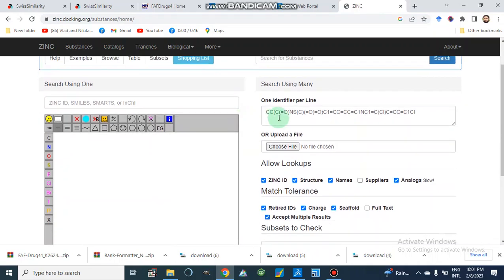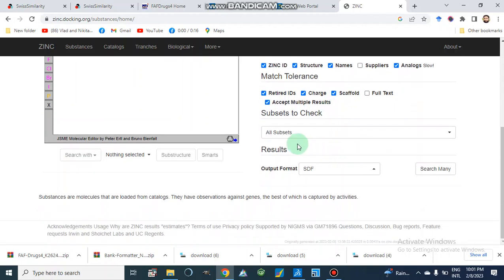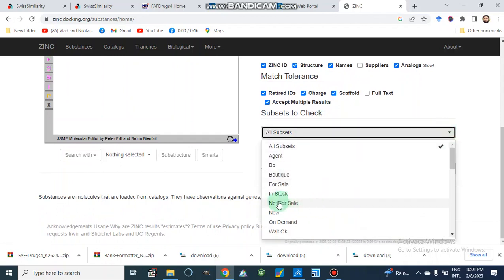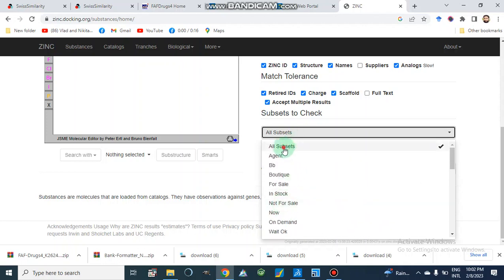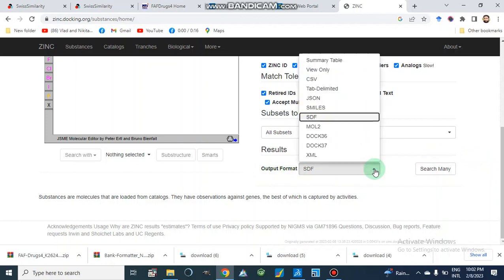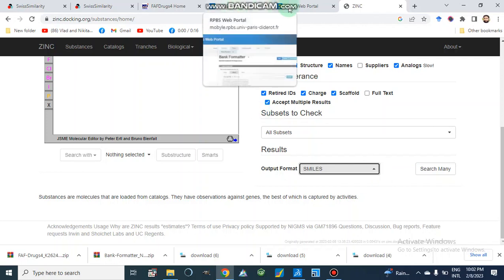Here, if we are going to use the ZINC database, we will make a compound and the SMILES of the compound will be pasted here, or we can choose a file which contains SMILES. On the basis of ZINC ID, structure names, analogs, suppliers, and other parameters, we can select compounds. We can also filter for sale, in vivo, in vitro, or select all subsets. The output file format may be SMILES or SDF file format.